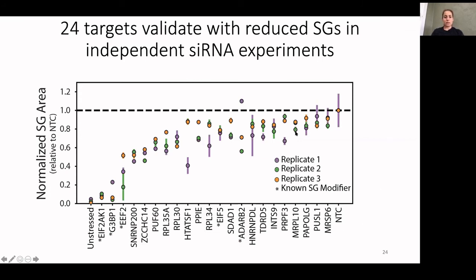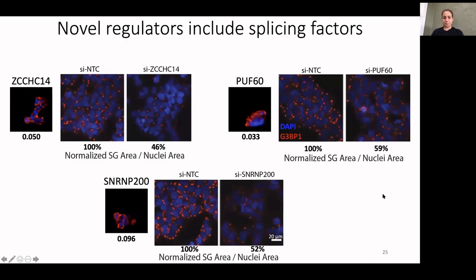And you can see that there's definitely a degree of variability in the total amount of stress granules that can be reduced by depletion of a single RNA binding protein. And again, this was pretty surprising, that we didn't find anything else that would deplete it as strongly as this kinase, although I guess maybe not too surprising given that that's essential for initiating this cascade. But this goes to show that manipulation of a single RNA binding protein in isolation is not enough to totally deplete granules in the cells.